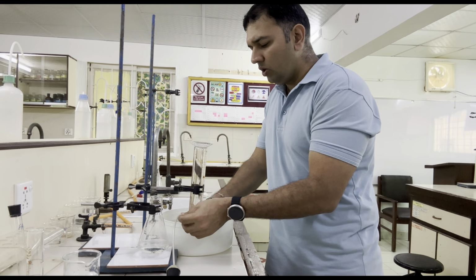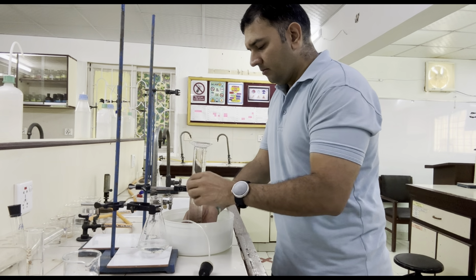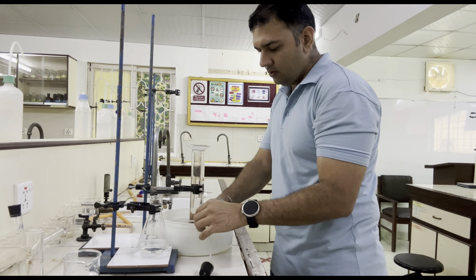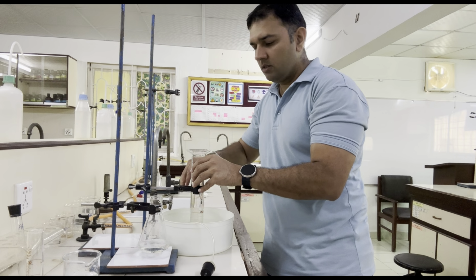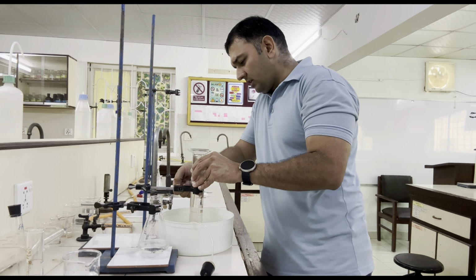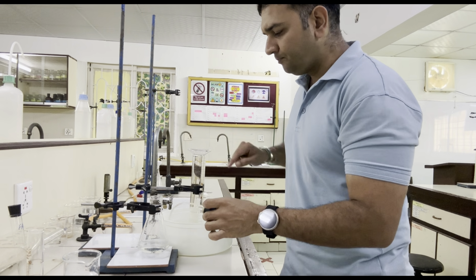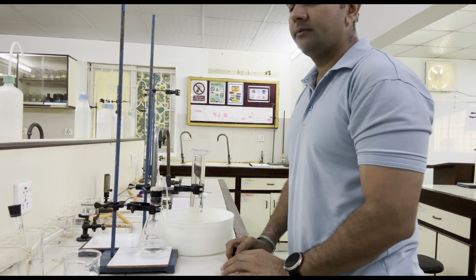And to hold this tube, you can move this measuring cylinder up to a bit lower level. So if you open from here and you take it a bit down, do not just press it, so that the tube will not be pressed. Keep it a bit loose. Now, the gas can easily pass through this tube to this measuring cylinder. And I have completed the task up till here.